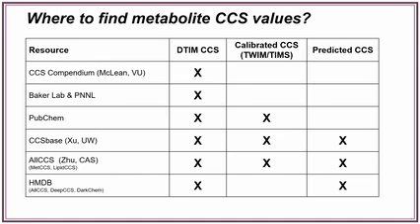And you can search this in all sorts of ways. You can put in formulas and come up with predictions. You can put in a mass and get back some potential identifications. You could put in a CCS value and get some identifications.